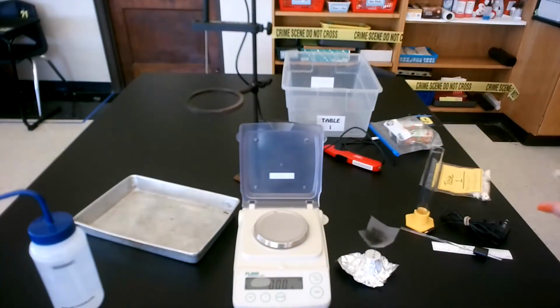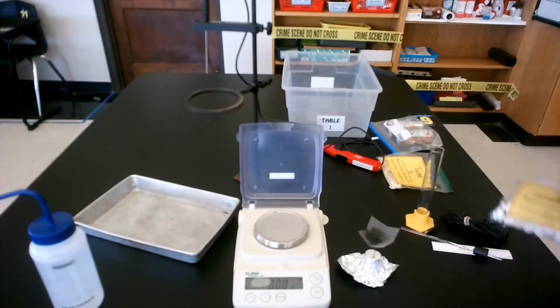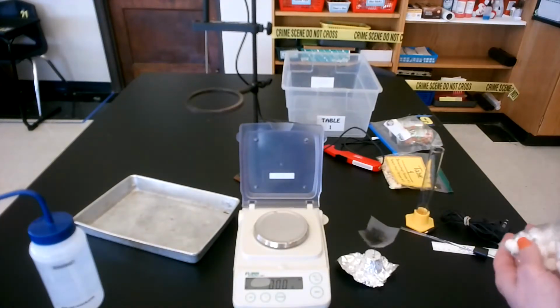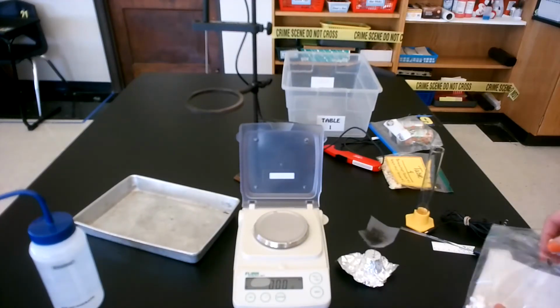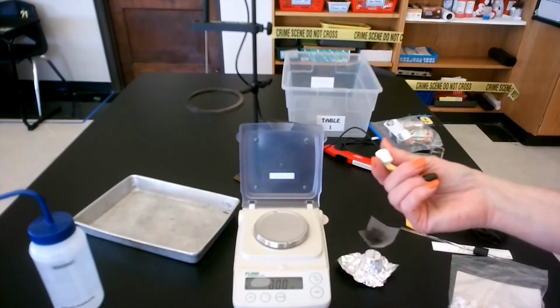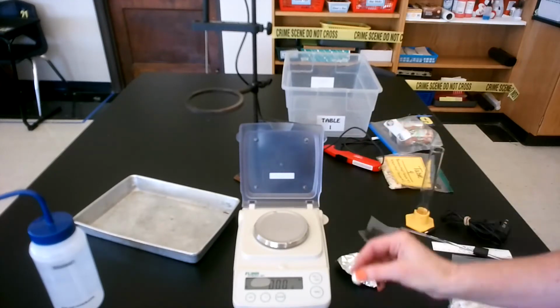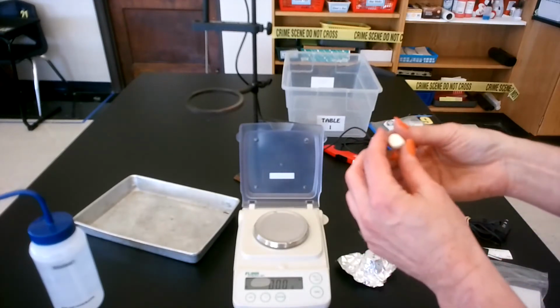So I'm going to take my food out. Let me just go ahead and do a marshmallow. And you may have the potato chip or the popcorn or whatever the case may be. Now, I should not have to say, do not eat any of this food. For example, the marshmallow. Okay, it's kind of hard.